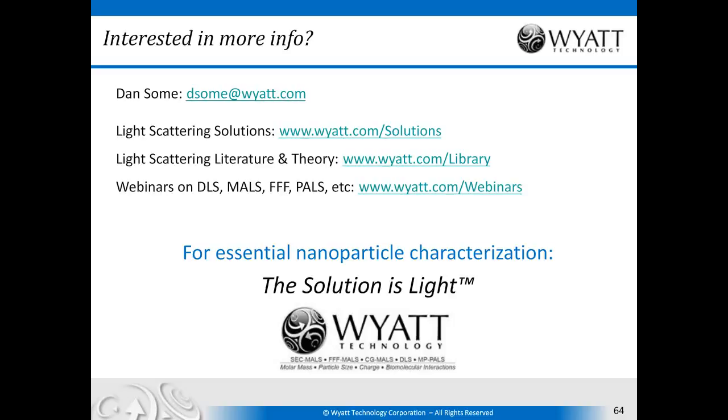Sometimes if you have a large nanoparticle encapsulating a small molecule drug, you would have to do that separation on field flow fractionation. But if you remember, the field flow fractionation configuration has a semi-permeable membrane, and the drug could actually escape through the membrane during the separation. But you can monitor the eluent of the crossflow. So you can put a concentration detector on the crossflow to see if any of that drug is escaping, and I actually expect to be able to publish an application note describing that sometime soon.